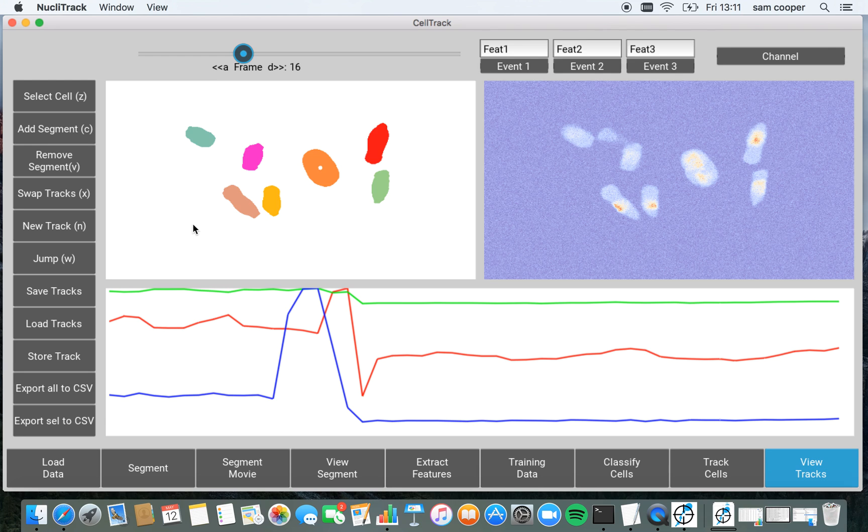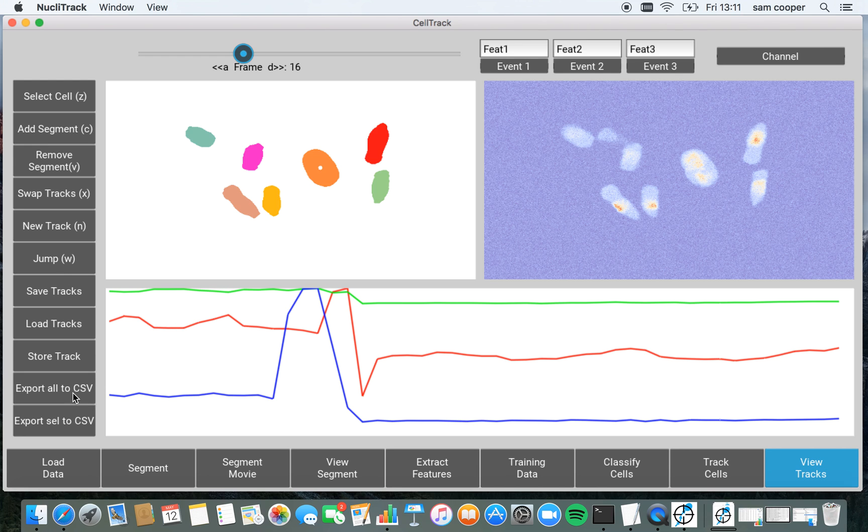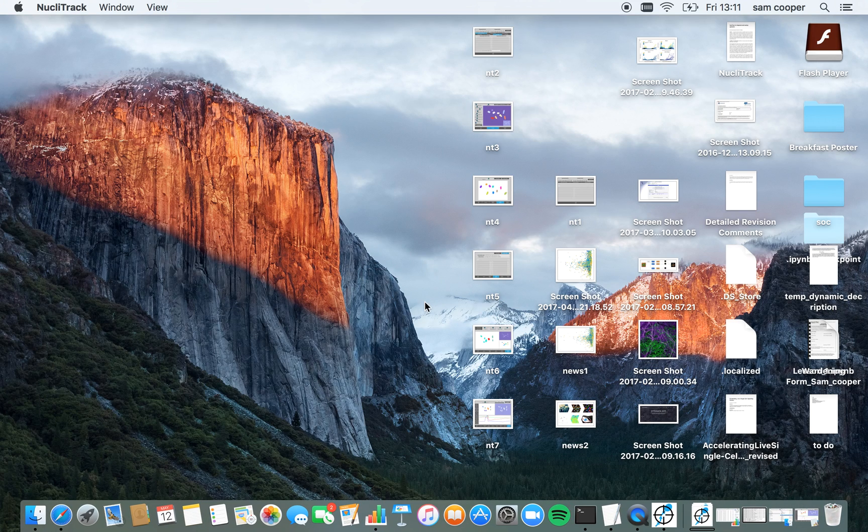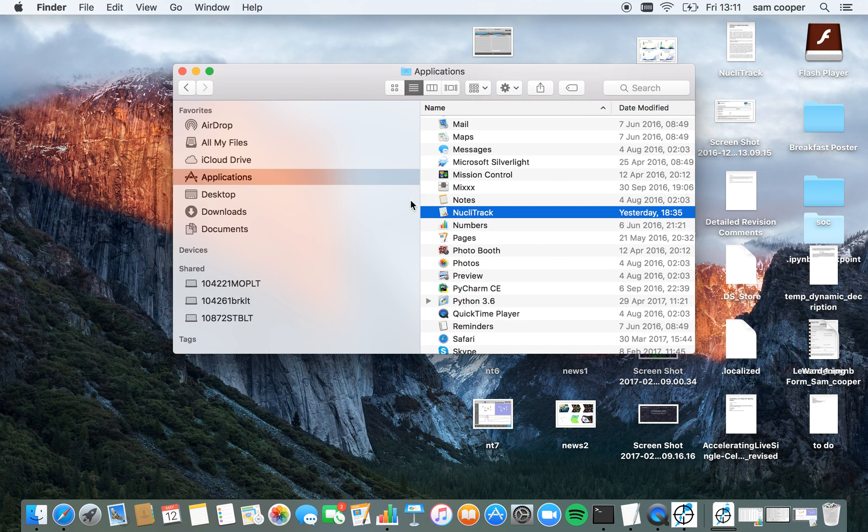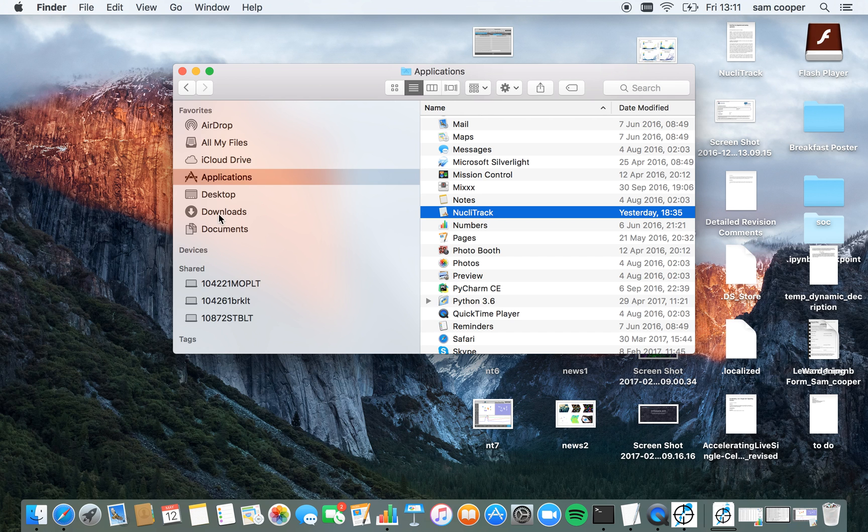Finally, we can now export all of these cell tracking data to a CSV file. So I'm going to click this button here, export all to CSV. And this is now an output in the same directory that I've saved my parameters in my data. This CSV file.